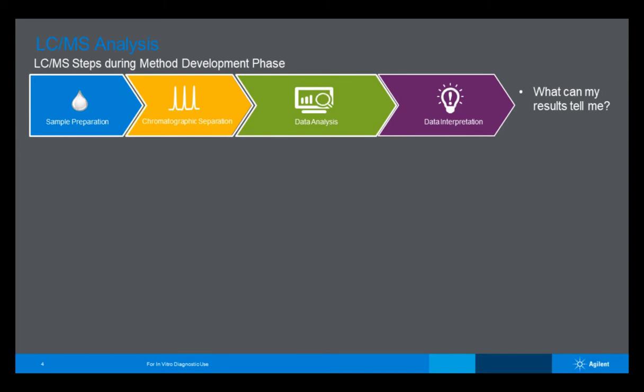And also important would be looking at the data interpretation. Specifically, they would be looking at the data interpretation from the vantage point of what can the results tell them. And finally, they would need to develop a comprehensive report to capture all of the findings of the sample prep, chromatographic separation, data analysis, and data interpretation.